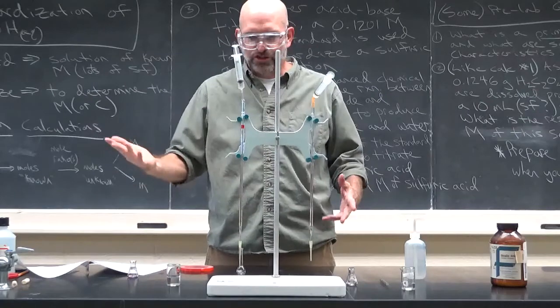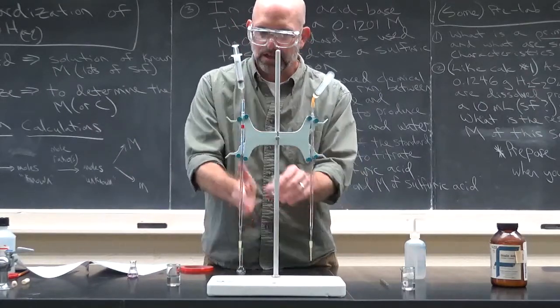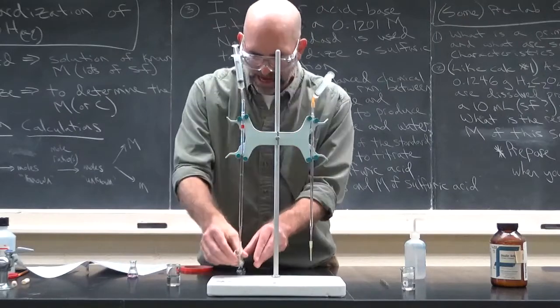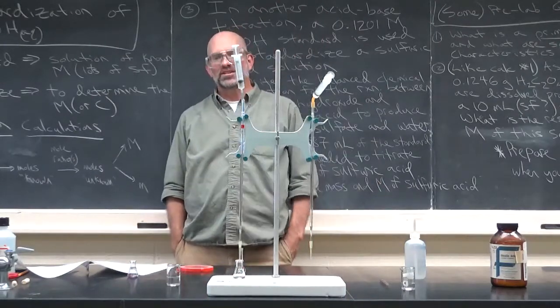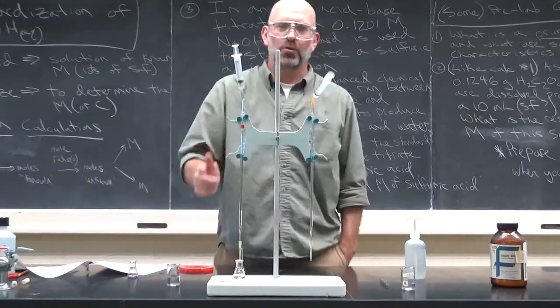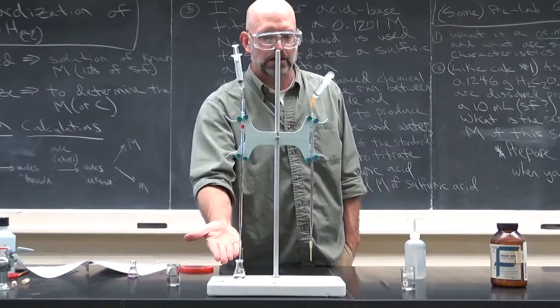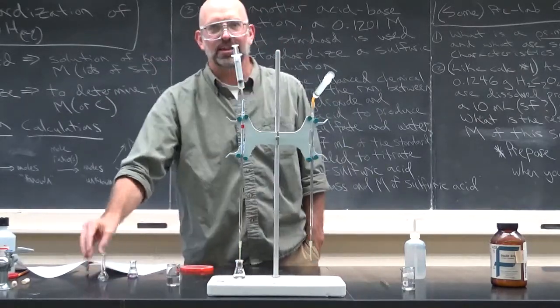Then you record the final volume to do the titration. That final volume becomes your next initial volume. Okay. And we'll make a data table. Okay. So the titration's ready to go. You have your acid here, dispensed it. You have your base here, and we're ready to titrate. There's just one thing that we have. We don't know when the reaction's going to be done.